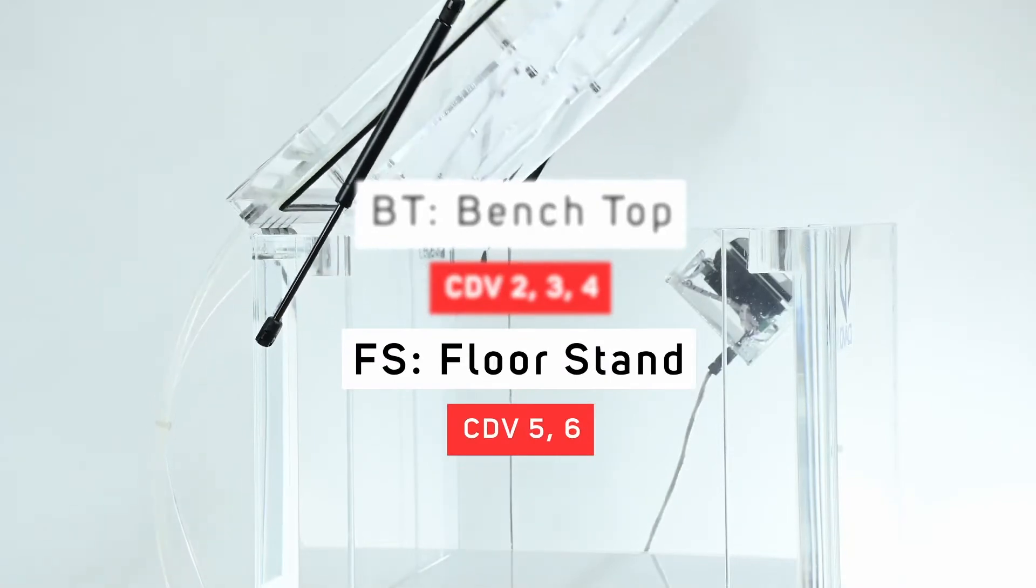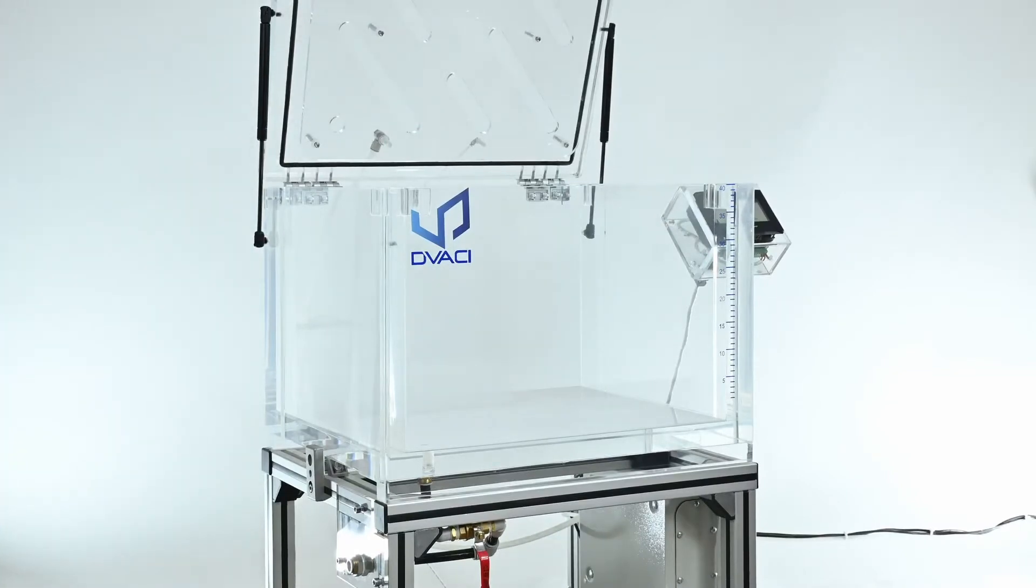We have a recognized know-how in the manufacturing of acrylic vacuum chambers and we can adapt them to your needs.